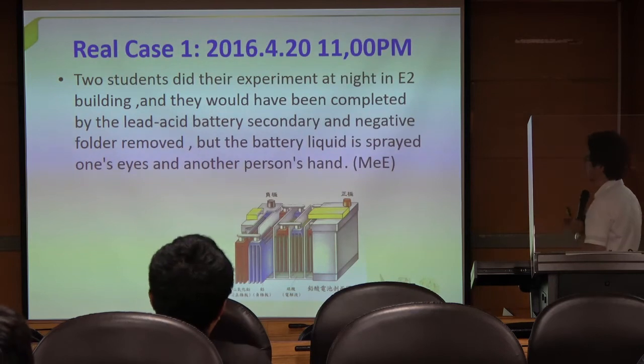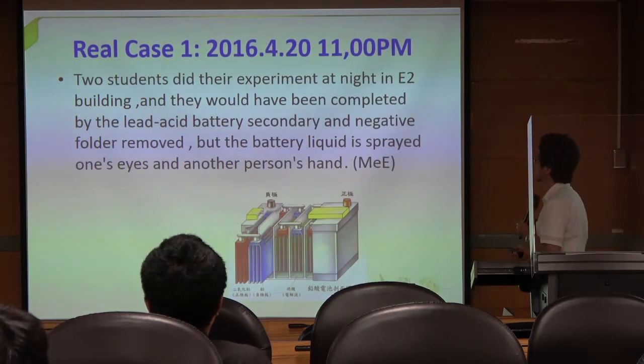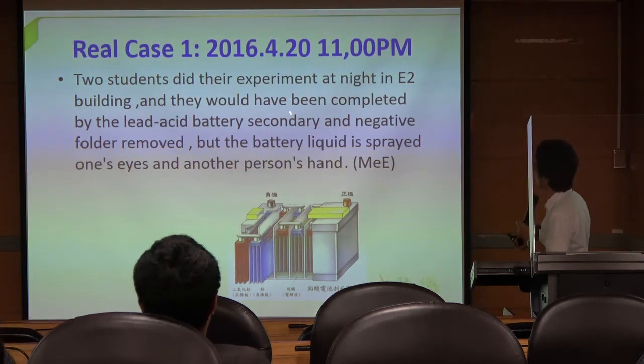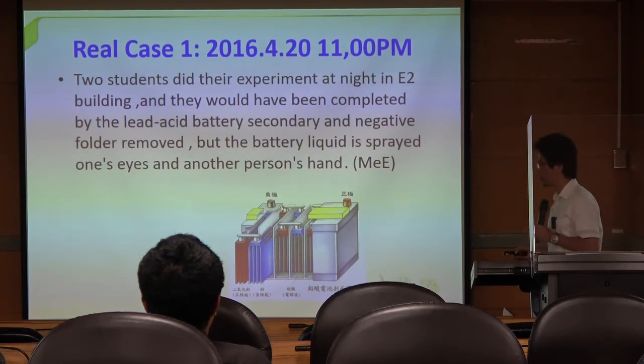Then I will jump to the real cases. Case one happened in 2016 at 11 p.m. Two students were doing an experiment at the E2 building. For the battery experiment, the battery liquid spread into one student's eyes and onto another person's hands. Those two students were hurt.